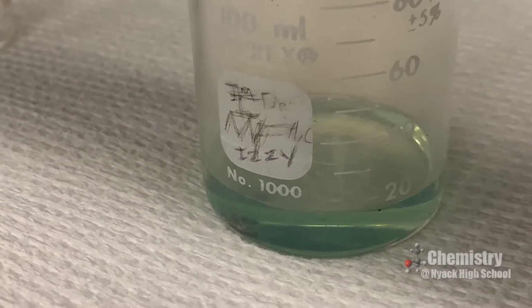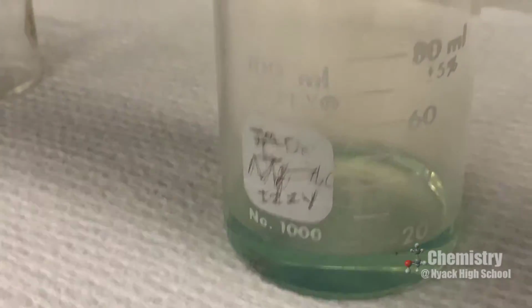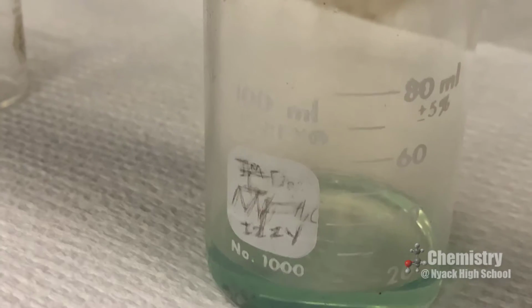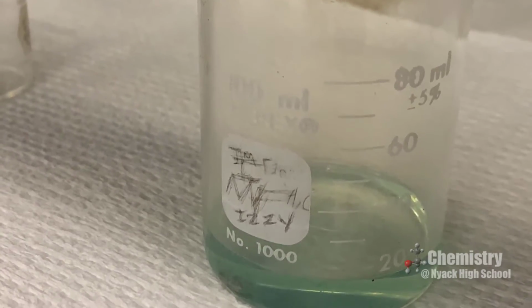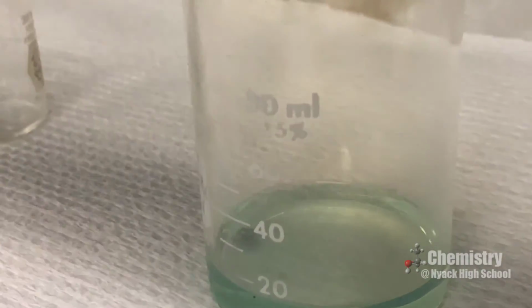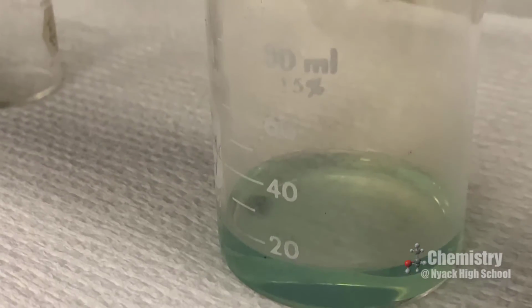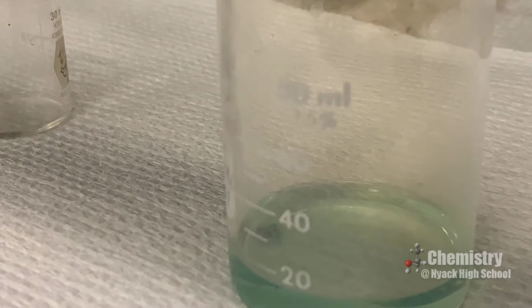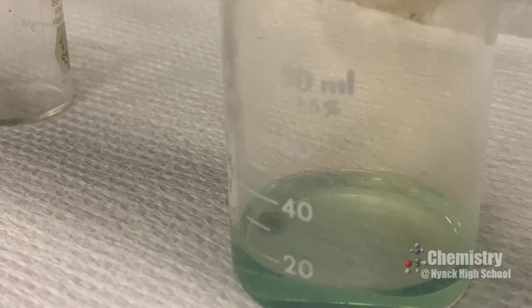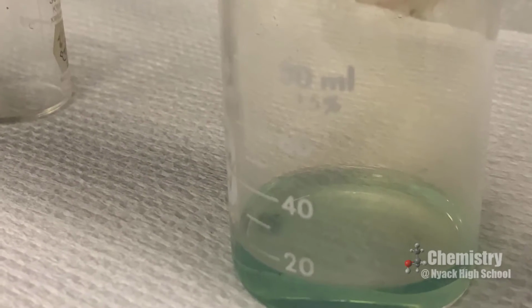3 minutes have passed. You may notice that the solution is now blue-green. You may see the faint appearance of a brown gas. Let me just turn this around a little bit. Maybe you can see this. Very faintly brown tinted gas above the liquid. That is the nitrogen dioxide, which is a toxic gas, which explains why we're doing this in the fume hood.